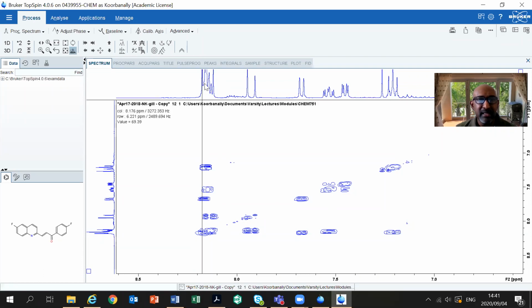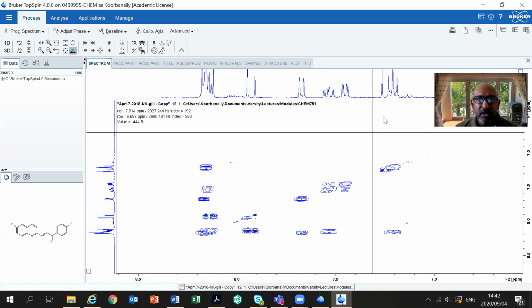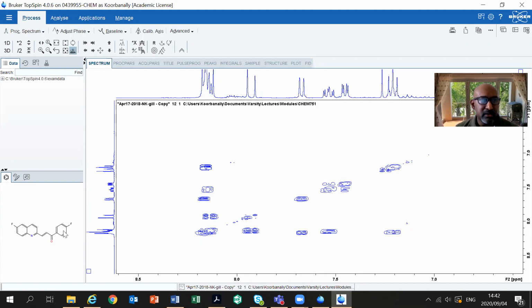If you could see it nice and clearly, this is a very nice example, because in some other spectra you see it very clearly as a doublet of doublets with an 8 and 5 Hertz coupling. So you can actually clearly see the double doublet in this case and not a pseudo triplet, right? It's coupled at 8 Hertz with the ortho proton and 5 Hertz with this fluorine atom. So you see a nice double doublet, which is slightly bigger than this double doublet here. We can actually see that in further examples. So I know that this is those two protons. I know that this is this proton here. I know that that is that proton there.